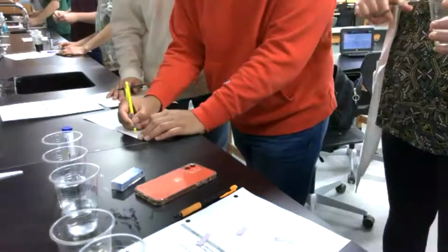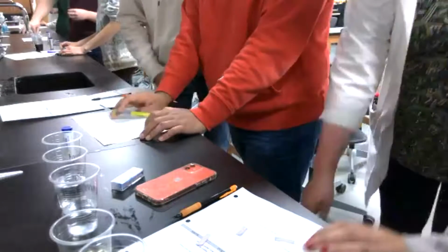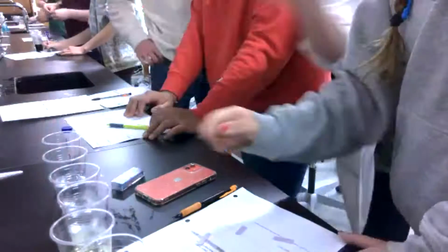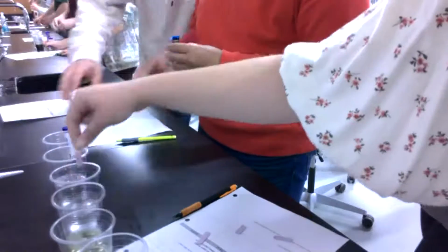Yeah, this is really long cup. It stayed red. Thank you. Here's your window cleaner back. Thanks. I want to stick my hands in it and then change the pH balance. Oh my gosh. Ooh, mine's actually turning blue. This is like blue and purple. Whoa, this one turned red. That's fun. Okay, well, at least mine are changing colors. Because none of them are acids.